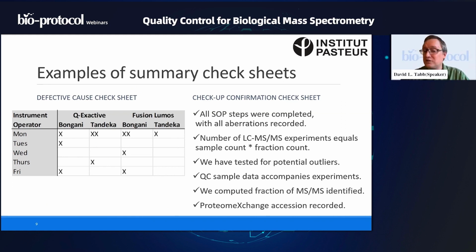So we have two different instruments. Both people used each of those two instruments over the space of these 6 months. And then I asked, on which days did each of those operators on each of those instruments have a failed run at some point in the last 6 months? Well, Bongani and Tendeka are really good. So generally speaking, they don't produce errors. But in this case, we can ask, did Bongani or Tendeka produce more errors on the instrument? So we could simply count.